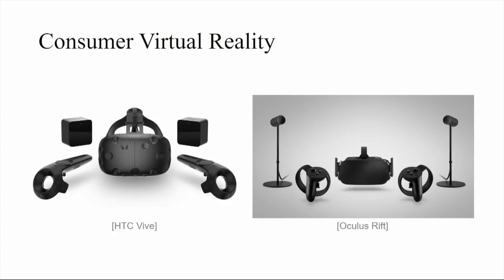So recent systems like the HTC Vive and the Oculus Rift are now available as off-the-shelf consumer products. They're affordable. I think they're both now about $600. They're easy to set up and maintain, and they can provide an immersive VR experience.